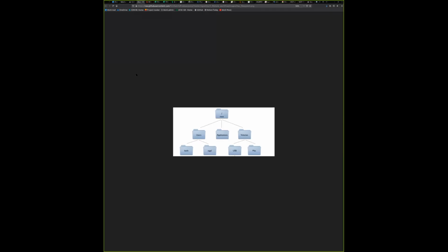If you can see from my sharing screen, if you're a Mac user, you're currently somewhere here under users. Most of you should be here. But then there is a parent directory above that, including users and also root. And then there are subdirectories under root, which contain other code and other files, such as applications. And if you have a USB thumb drive plugged in, you have another directory called volumes as well. It's actually quite convoluted.